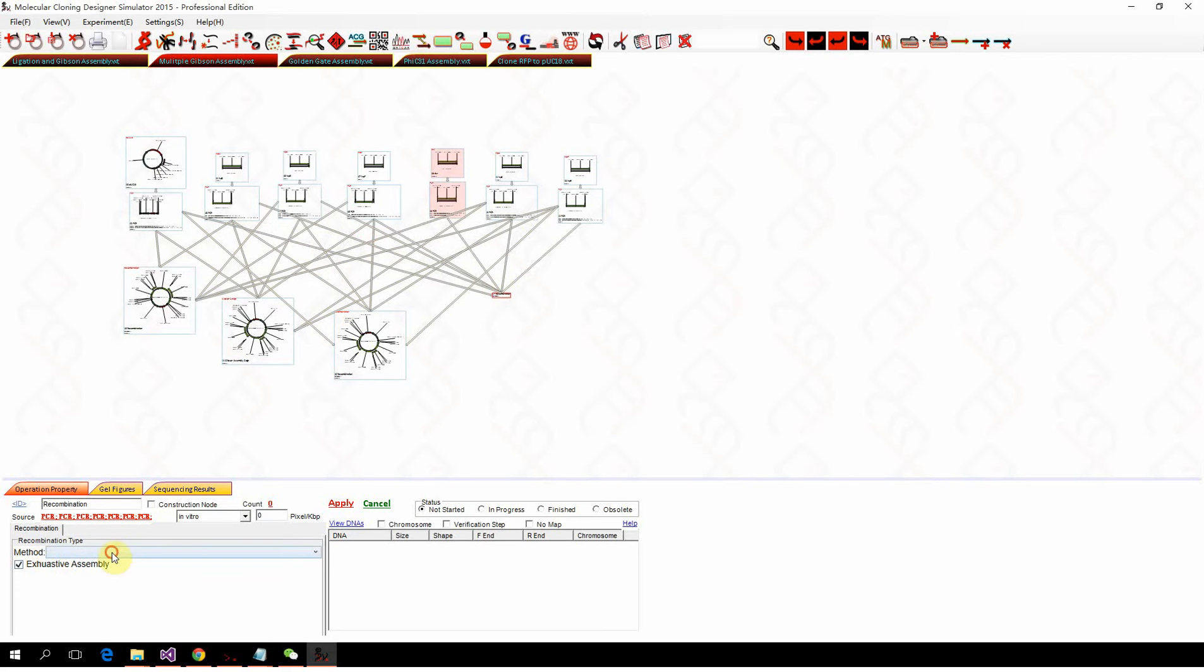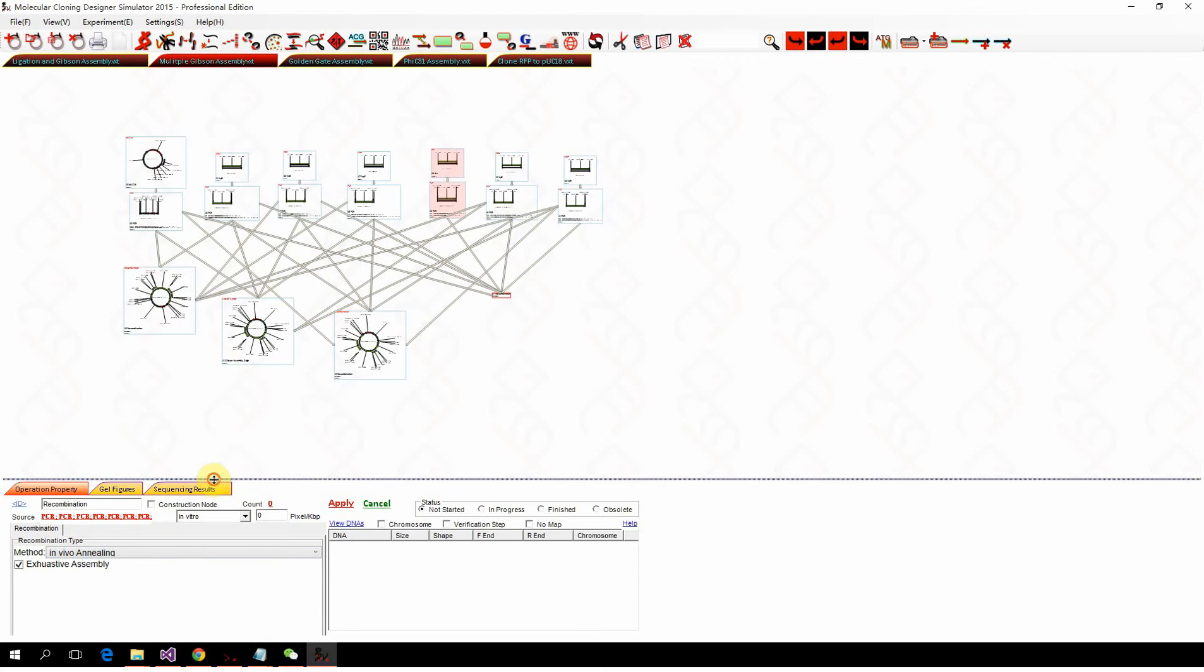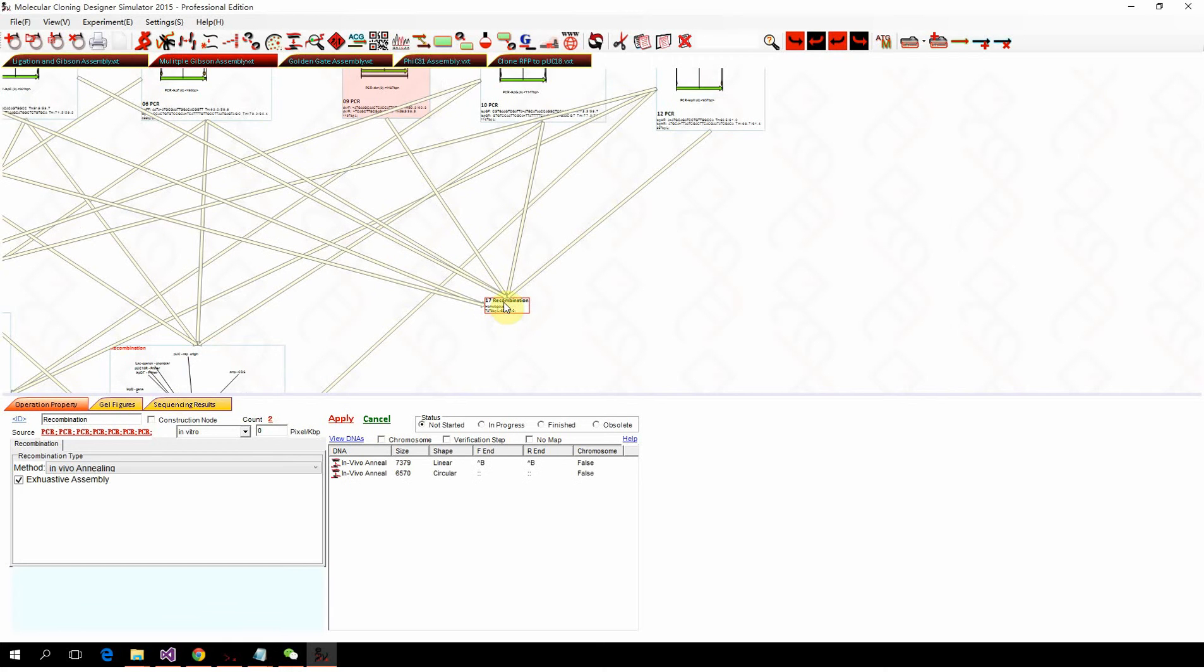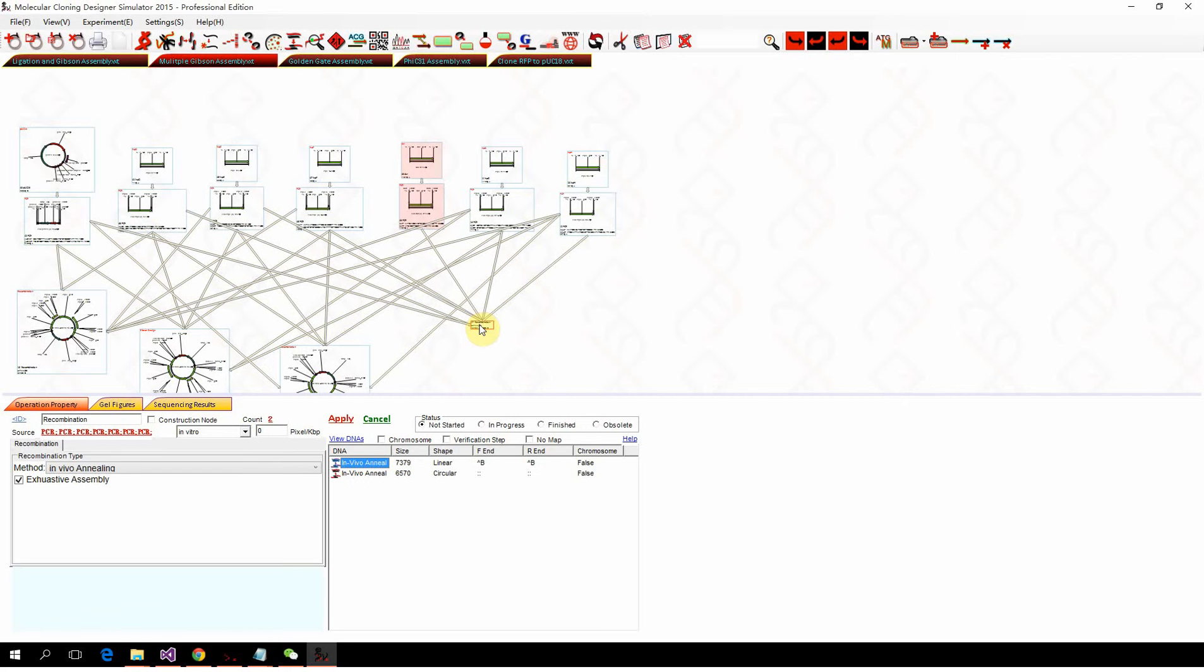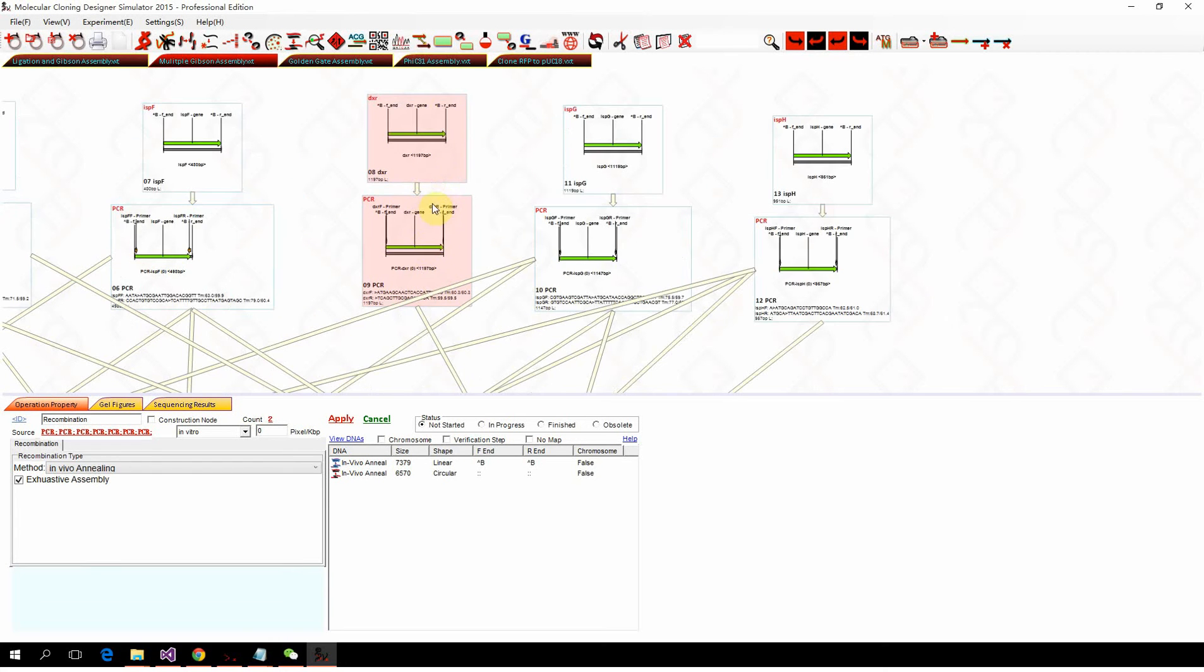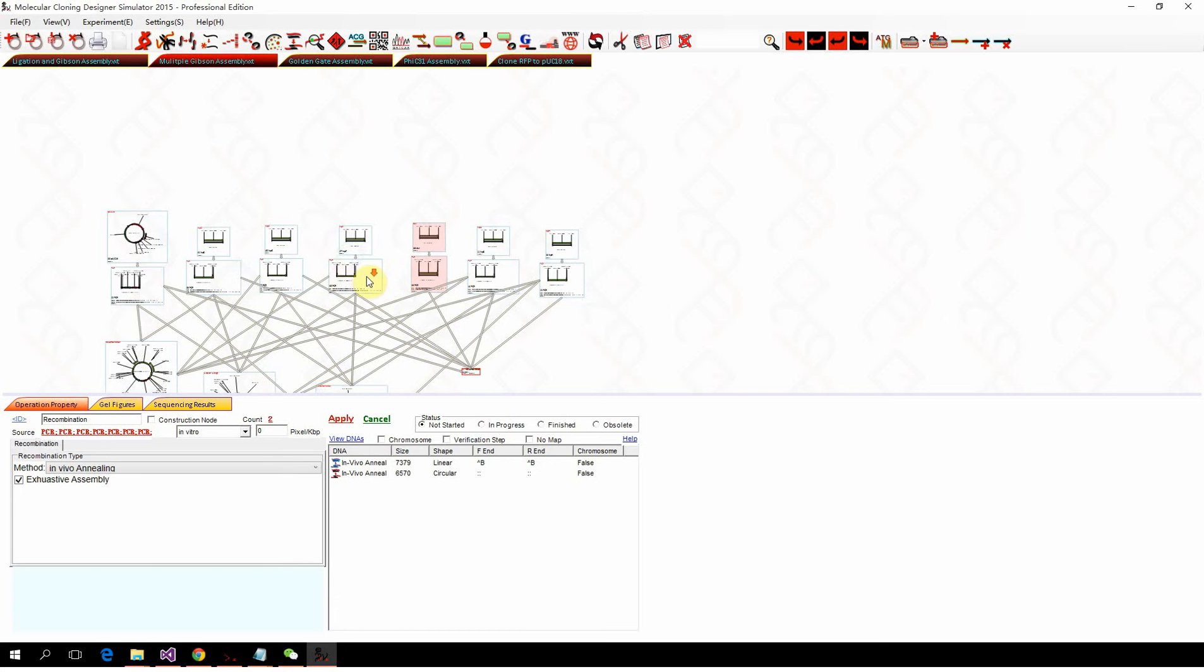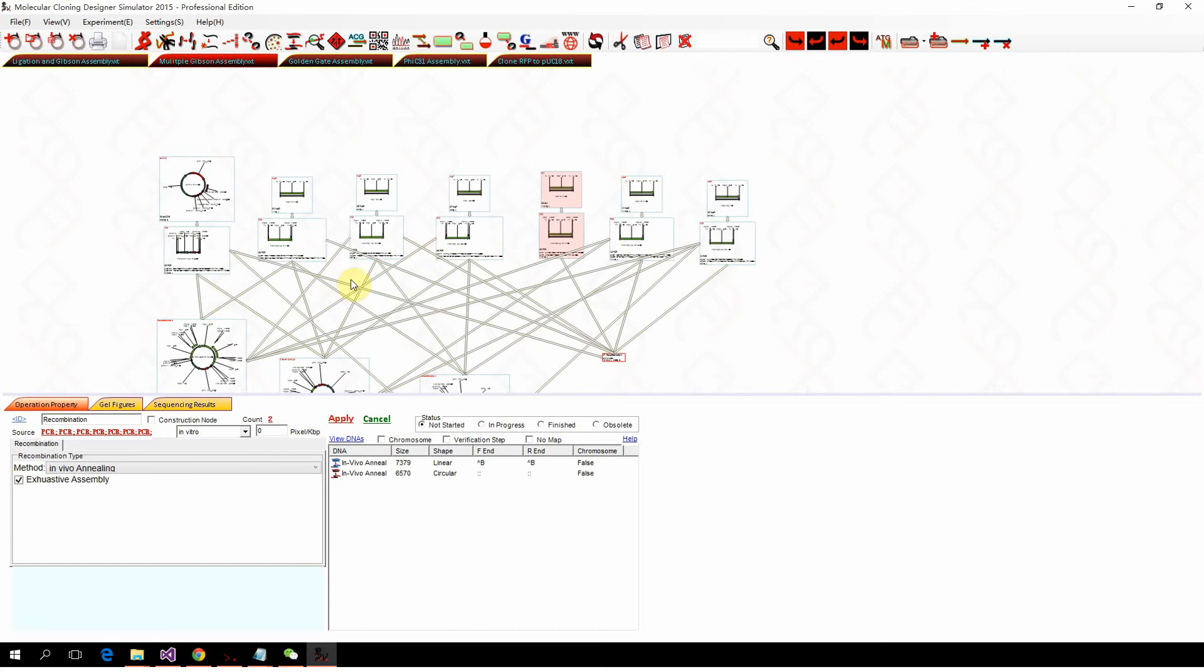For example, we perform the recombination with the in vivo annealing mode and exhaustive. We click apply, and here you won't get one single product; you actually got a byproduct. The reason why is because you have one fragment that can't perfectly join into the rest six.